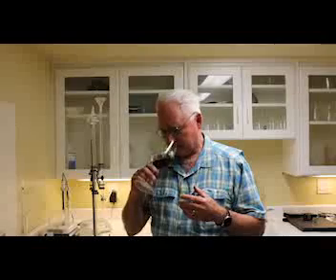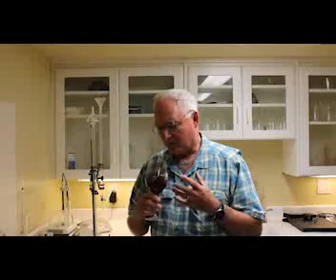So now that I'm smelling the wine, I'm picking up that there's no noticeable VA in the wine, which is a good thing. And so I want to make sure that that's not there. I'll taste it.